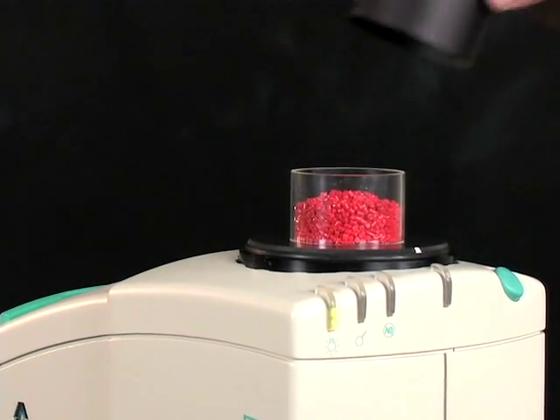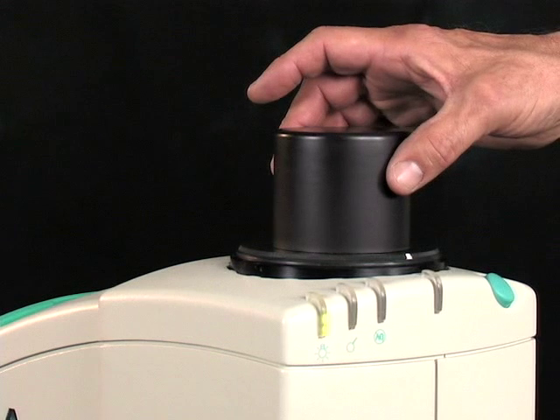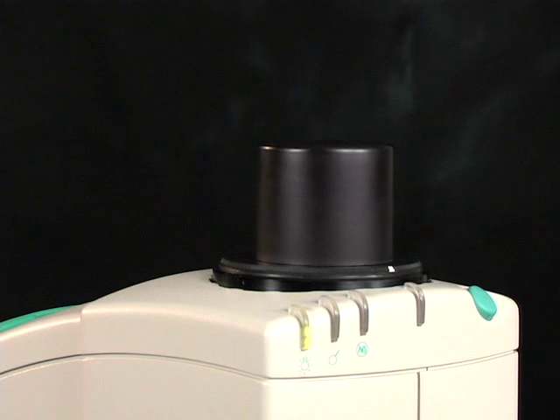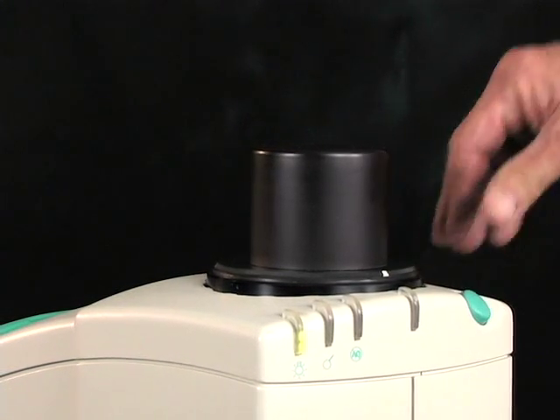The sample cup is then covered with the opaque cover. The cover eliminates the possibility of ambient light affecting the measurement. The read button is then pressed on the LabScan XE to take a reading.